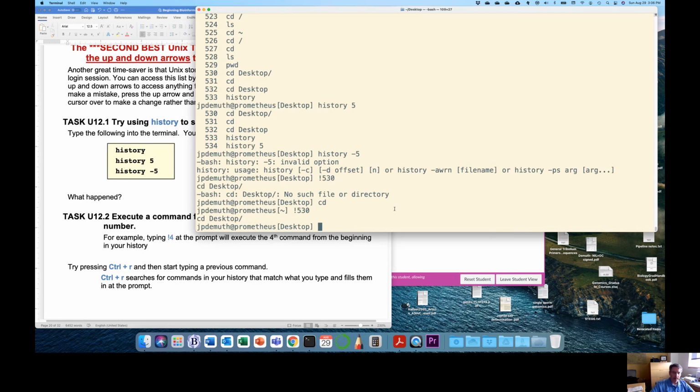Even better than that, if you know it's really recent, you can hit the up arrow. After the tab complete, that's the best pro tip I have for you. The second best is use your up arrow. If something doesn't work, you just got done typing out a big long command, right? Don't retype the whole thing and risk making a different typo. Instead, hit the up arrow and then move over and correct your typo. Just fix that part.